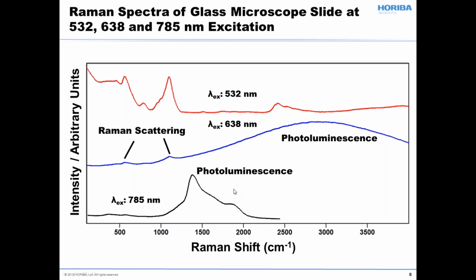Now, I say this is very important. Why? Because for a lot of people who might be working with biological samples, they're typically using glass microscope slides, and they're doing their imaging with either reflected or transmitted white light. Those materials themselves, say biological cells, are transparent, and they will often fluoresce at shorter excitation wavelengths, so they choose 785 nanometer excitation. But it's not wise to analyze those kinds of materials on a glass microscope slide because of all this photoluminescence, you see?